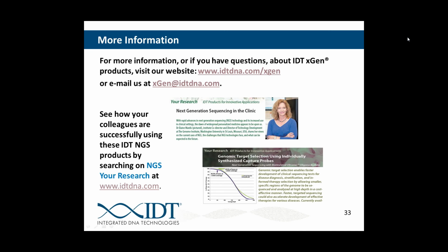Yeah, that's a really good question. We generally don't recommend going too large because that will affect the capture. I understand why you might want to go larger in order to ensure that the flanking regions are actually incorporated into the fragment with your either transposon or viral genome. But if you go too large, and I think the cutoff is probably going to be, I would start at 600 bases, but you may be able to go up a little bit larger, and I'll see what we have in research. If we've tested a lot larger than that, you could potentially go up to 900 bases and test to see how well that works.